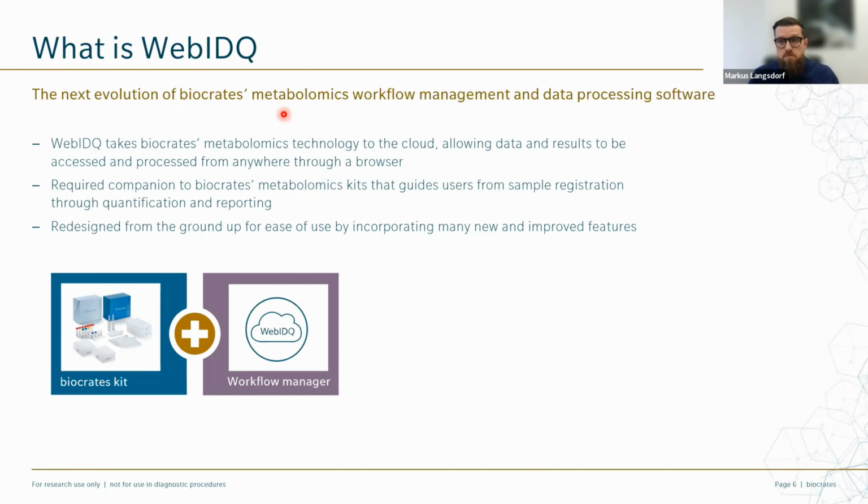WebIDQ is the next generation of our workflow manager and the successor of the legacy MetIDQ software. It's a cloud-based software which allows you to have access from anywhere through a web browser. It is a required companion to our kits that guides you through the entire workflow, all the way from sample registration and customizing the plate layout through data processing, quantification, data normalization, and finally exporting the results in various file formats. So a WebIDQ subscription is needed to run biocrates kits and to process kit-generated data.